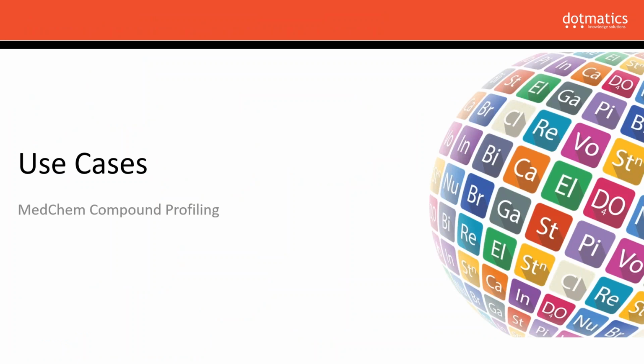So now we're going to go through the 4 use cases. I'll introduce each one. And again, these are not comprehensive. They're just designed to give you an understanding of the breadth of the product and what can be done with it. So I'll go through each one of these, and then Tedman's going to demo them.